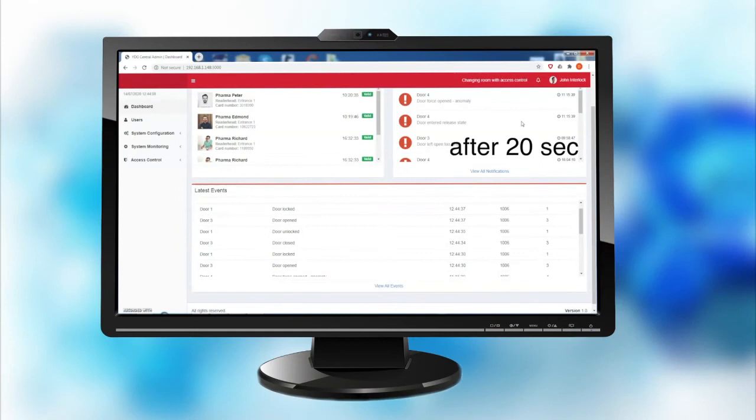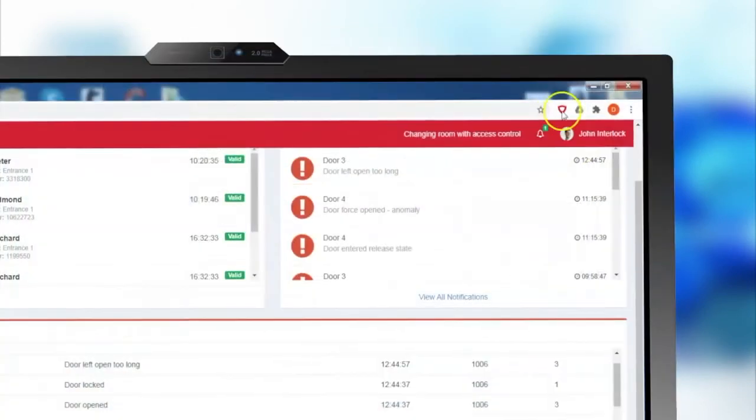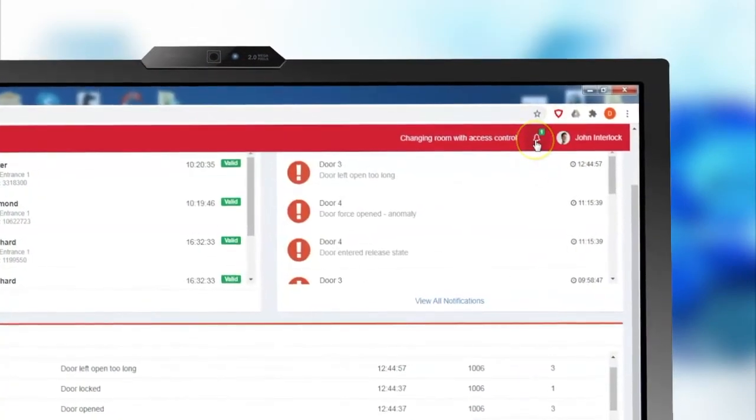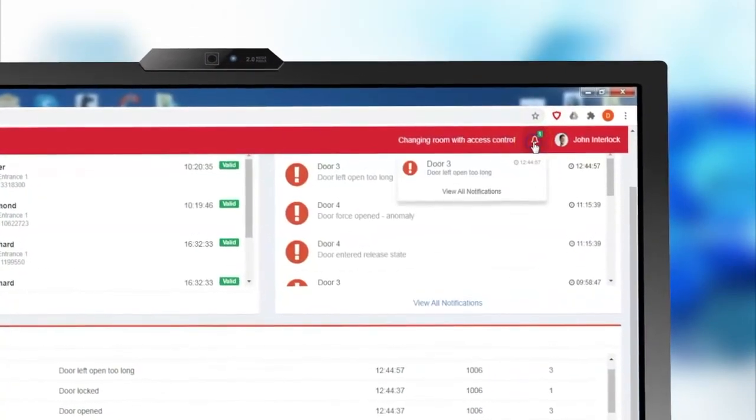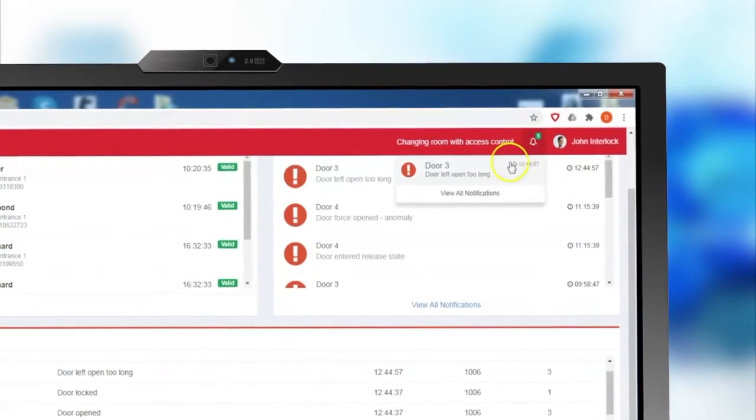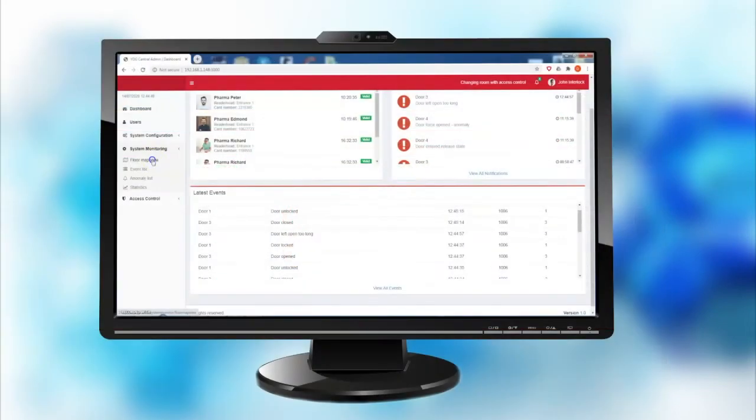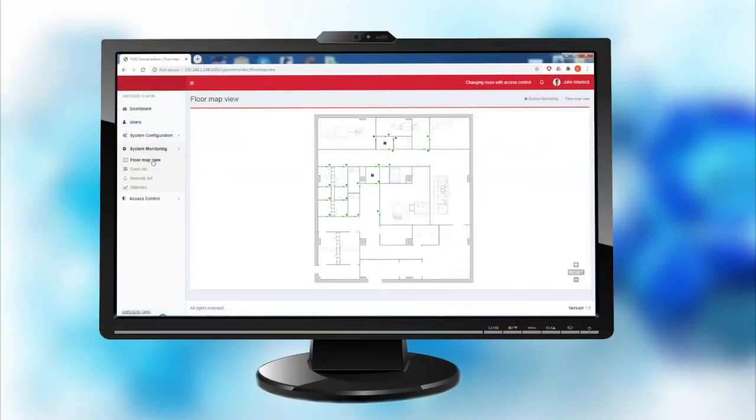A dedicated section shows the incorrect operation of doors, such as a door left open for too long a time. The same events may also be visualized in an interactive layout.